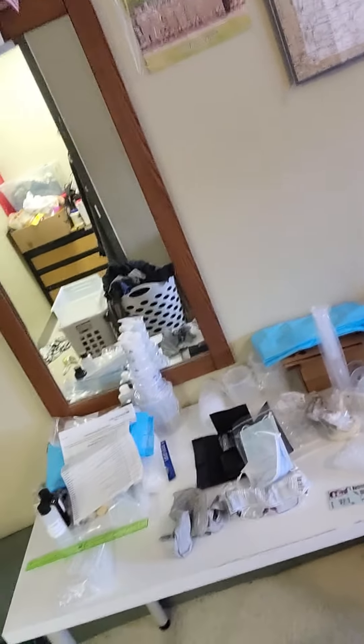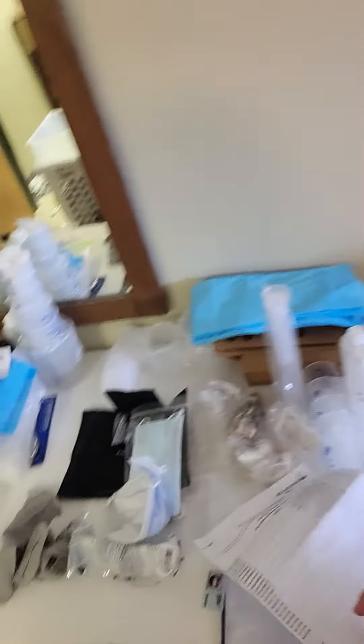I'm also taking general biology — that's another lab kit — but this is everything for the anatomy and physiology class. I confirmed that I received everything on the list. I did an inventory, and everything looks good.